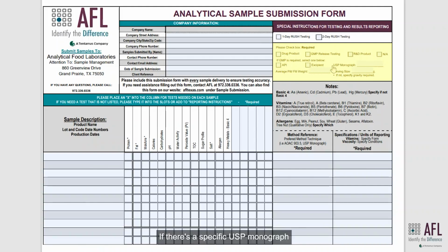If there's a specific USP monograph that you need us to follow, type it in this box. If it doesn't fit, you can include an email to us, again, to AFL or to the chemistry department, Dr. Stephen Wuller, and we will get it logged in correctly.